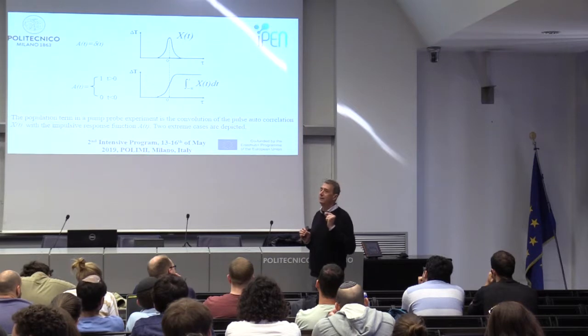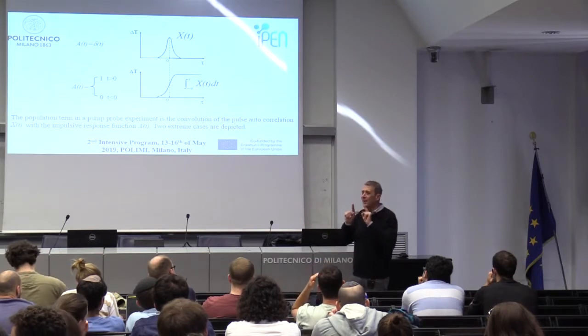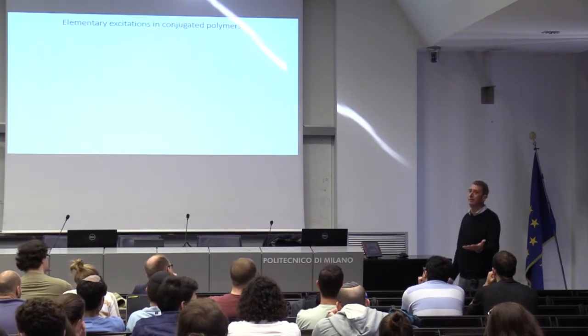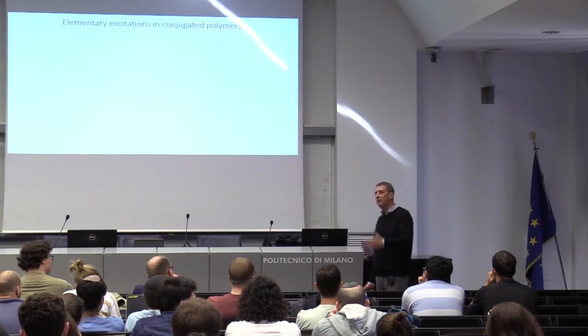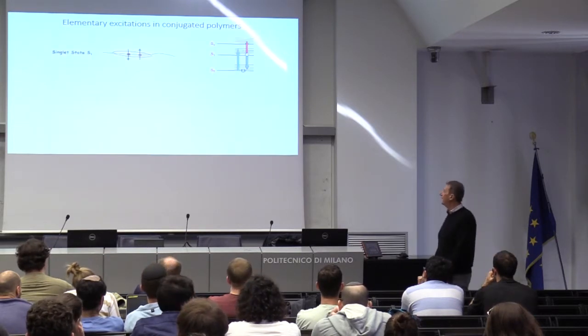In principle, if you have zero noise, you can do this, because you see the mathematics, you can. The correlation is changing a bit, but it is never zero noise. So I don't believe it; it's much better to make shorter pulses. If you want to measure something faster, you go with a laser which has short enough pulses. If your pulses are too long, you look for pulses that are short enough.